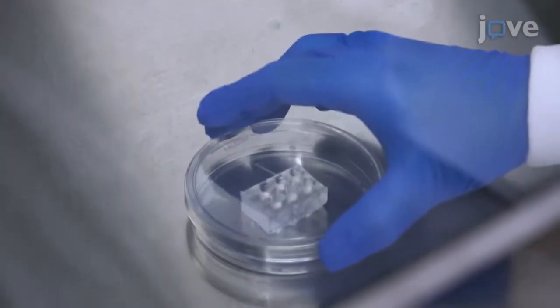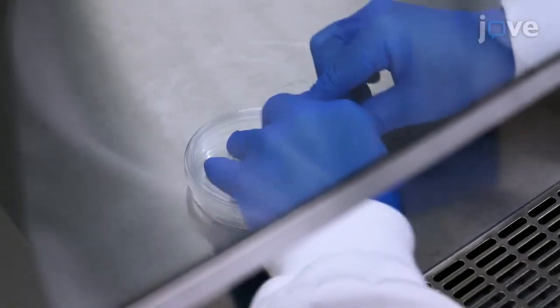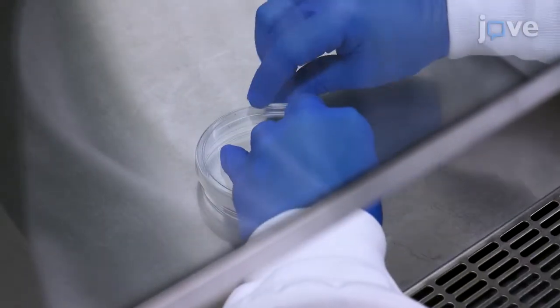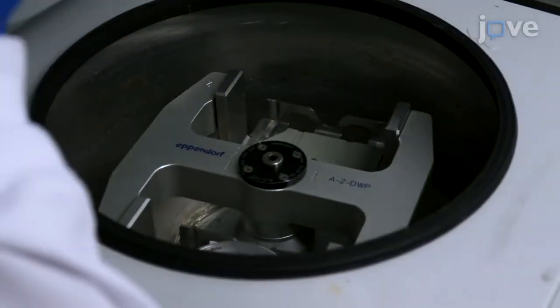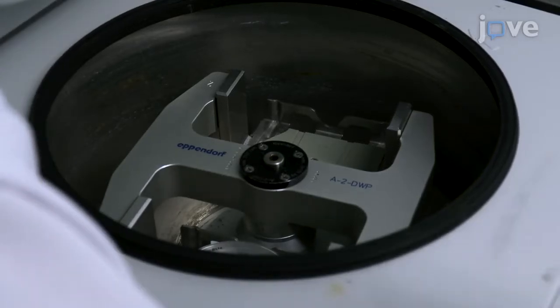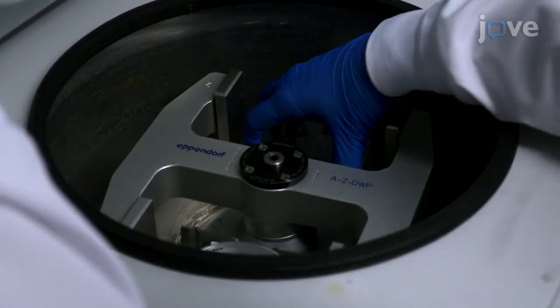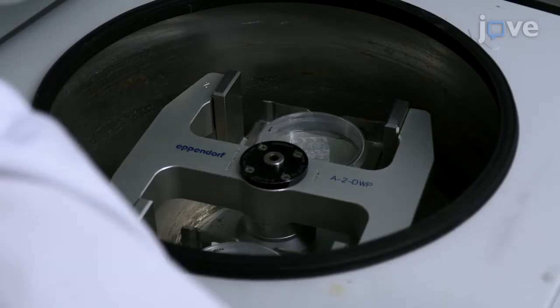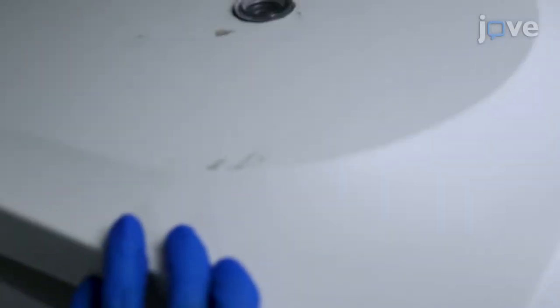Use the lid to cover the wells and apply paraffin film to seal the dish. Centrifuge the dish at 1550 times G for one minute in a centrifuge outfitted with a plate spinner adapter.